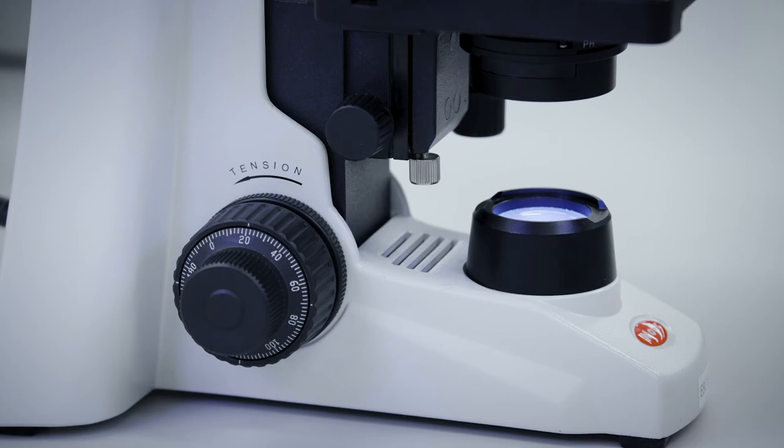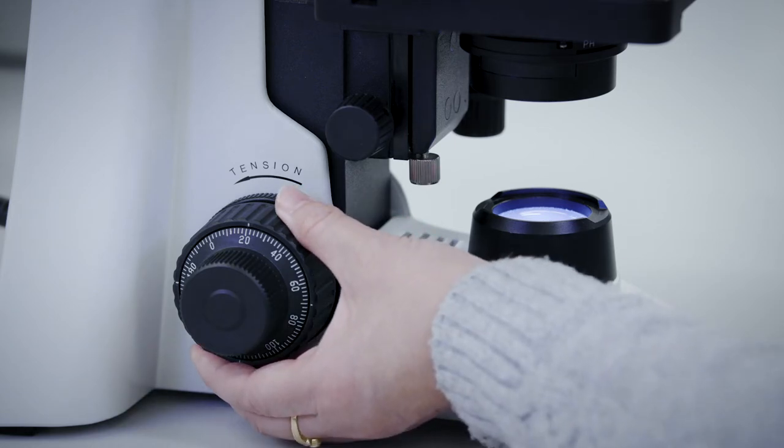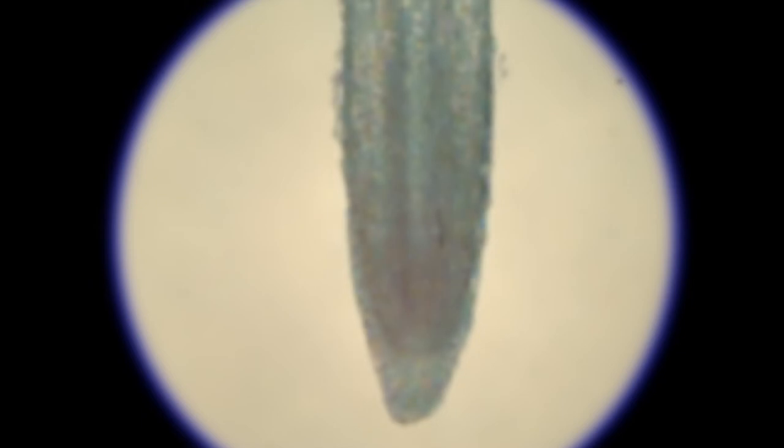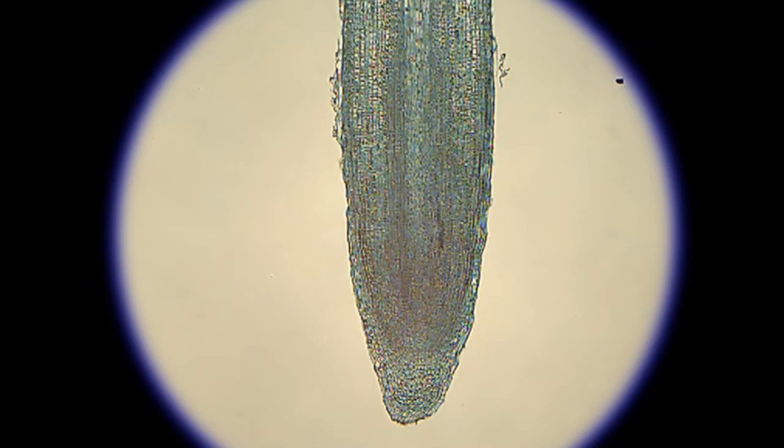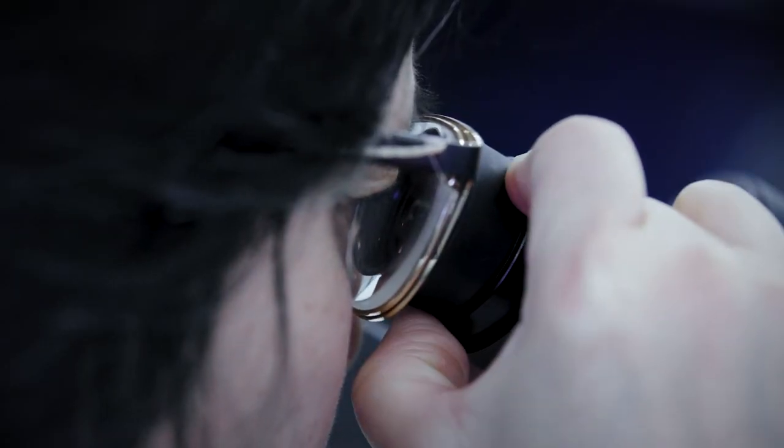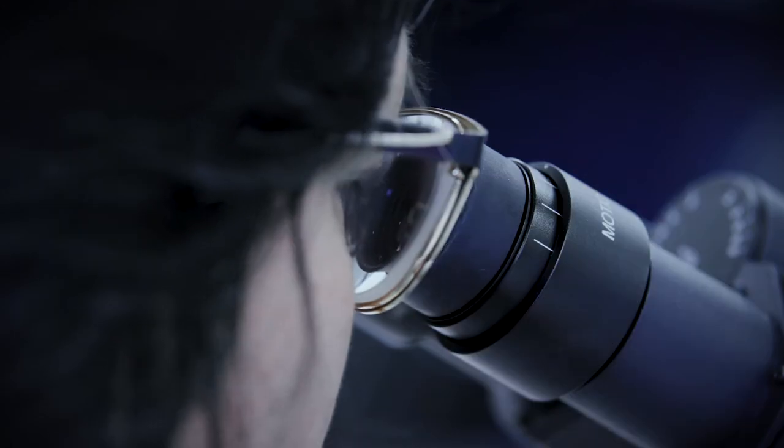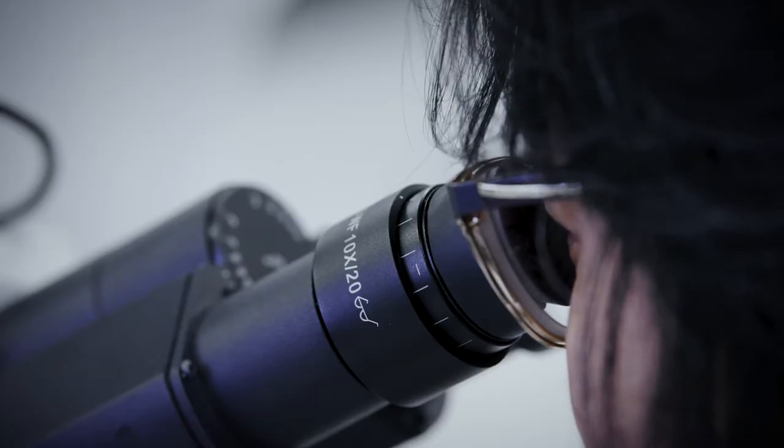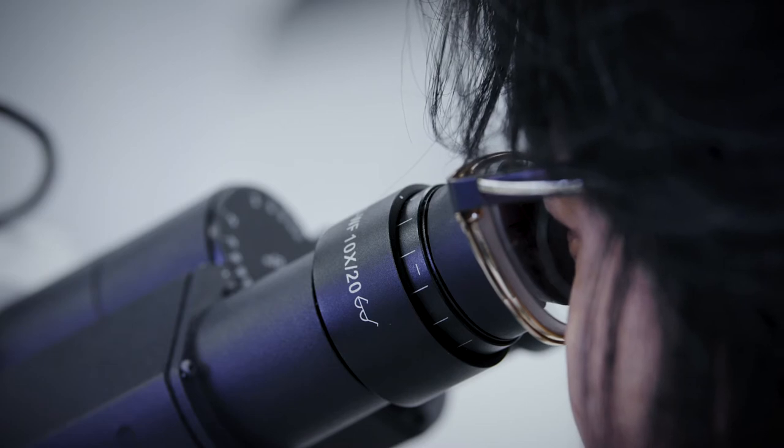Looking down into the oculars, focus the image to the sharpest for your left eye by first rotating the coarse focus knob, then the fine focus knob. Then focus the image for your right eye by turning the ring on the right ocular. By doing this, the difference of focus between your eyes can be compensated.